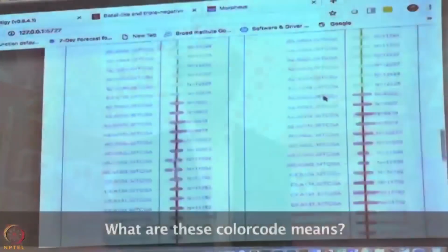It will be more robust if there are fewer offending samples. But you shouldn't throw away samples simply to get a better result. But if there is an experimental reason why some sample failed, you can remove that sample and redo the analysis. I think that's about it. I'll stop there. If there are any quick questions, I'll answer.